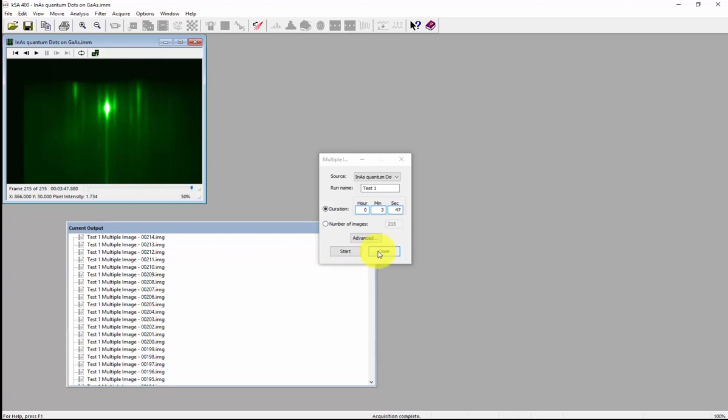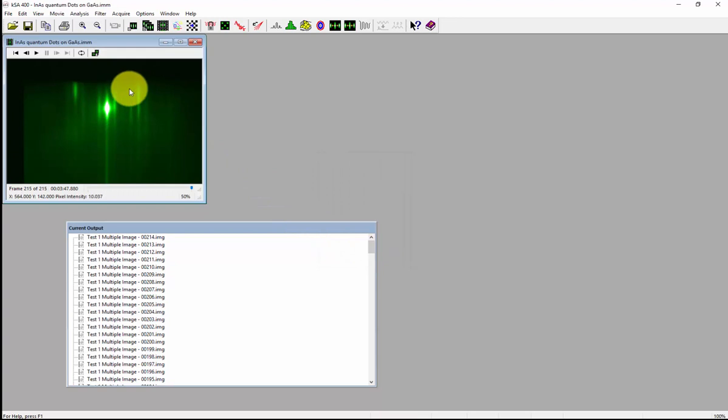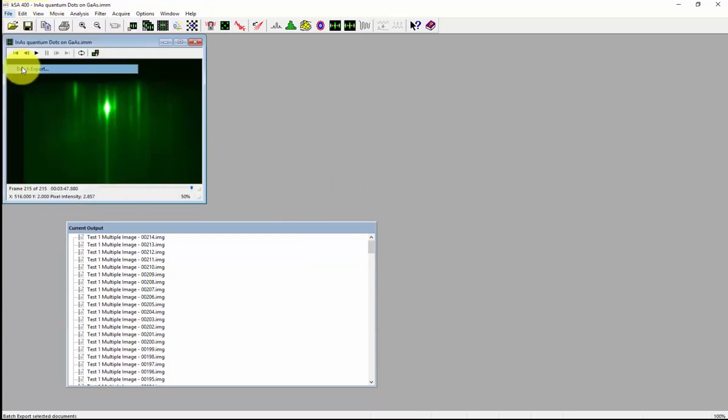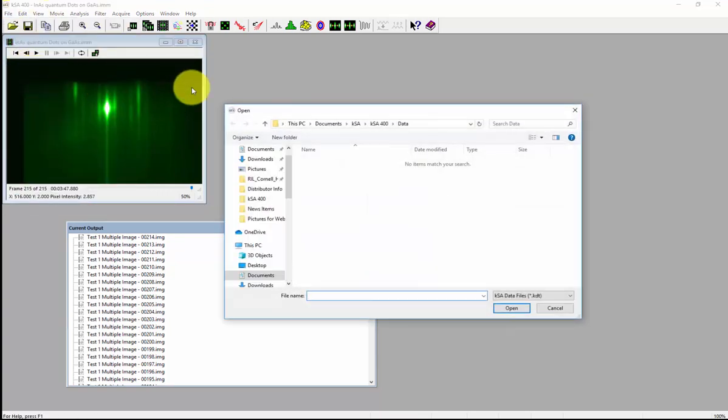Next, close the multiple images window. From the top menu, click file and then batch export.